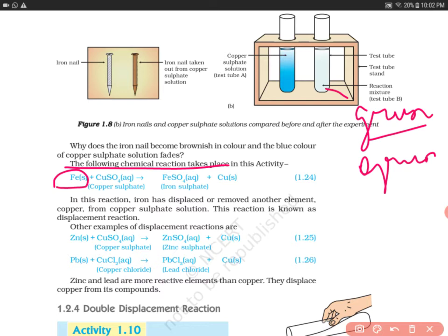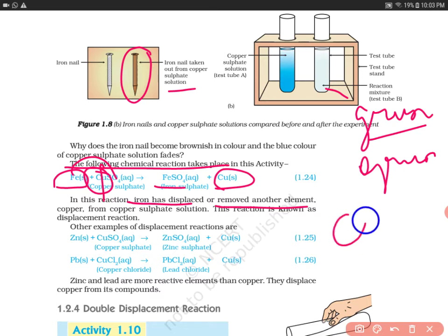In this reaction, iron has displaced copper. The iron takes the place of copper with sulfate, forming ferrous sulfate, while elemental copper is deposited on the iron nail — which is why the iron nail turned brownish. This type of reaction is known as a displacement reaction.